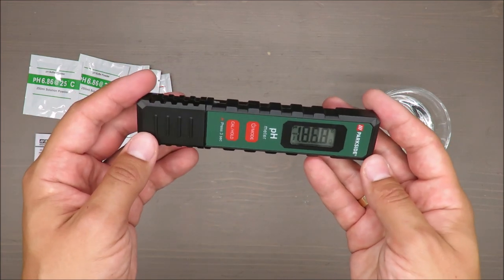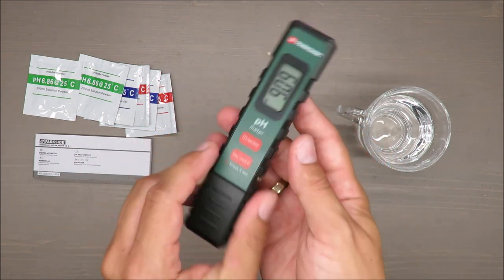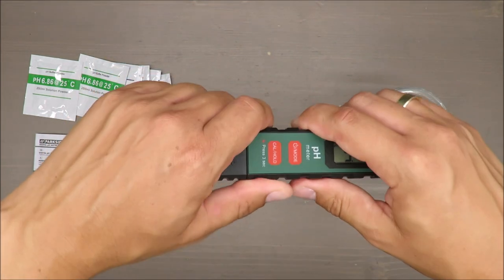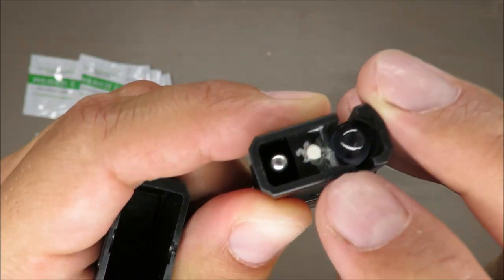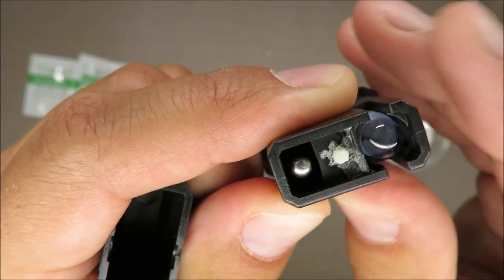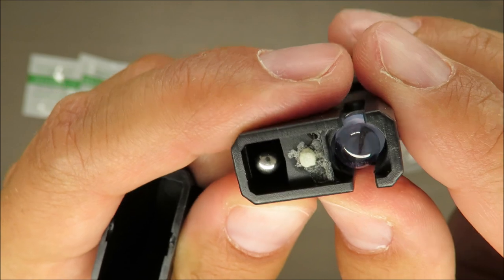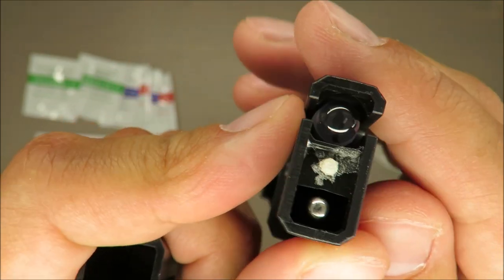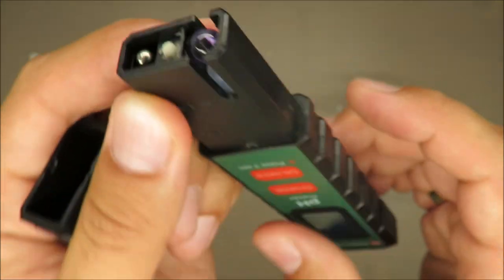First of all, the impression is rather good, actually nothing to be said. One thing that worries me is I don't know what this is, but it doesn't look nice. So if you are an expert please share in the comments what it is, but from my perspective something went wrong. I mean it should not look like this.